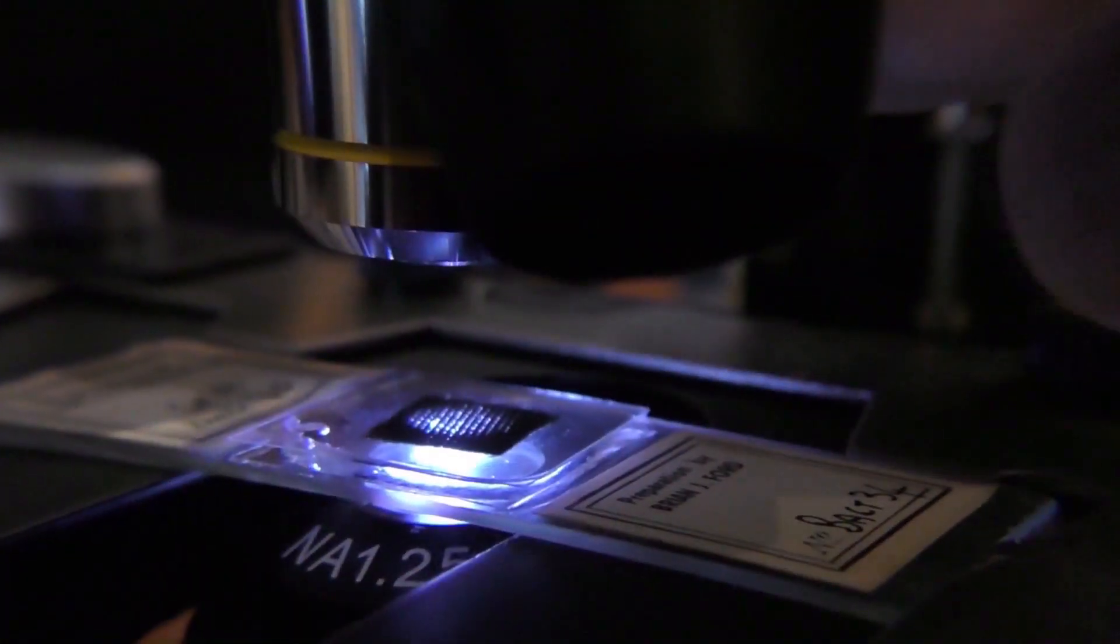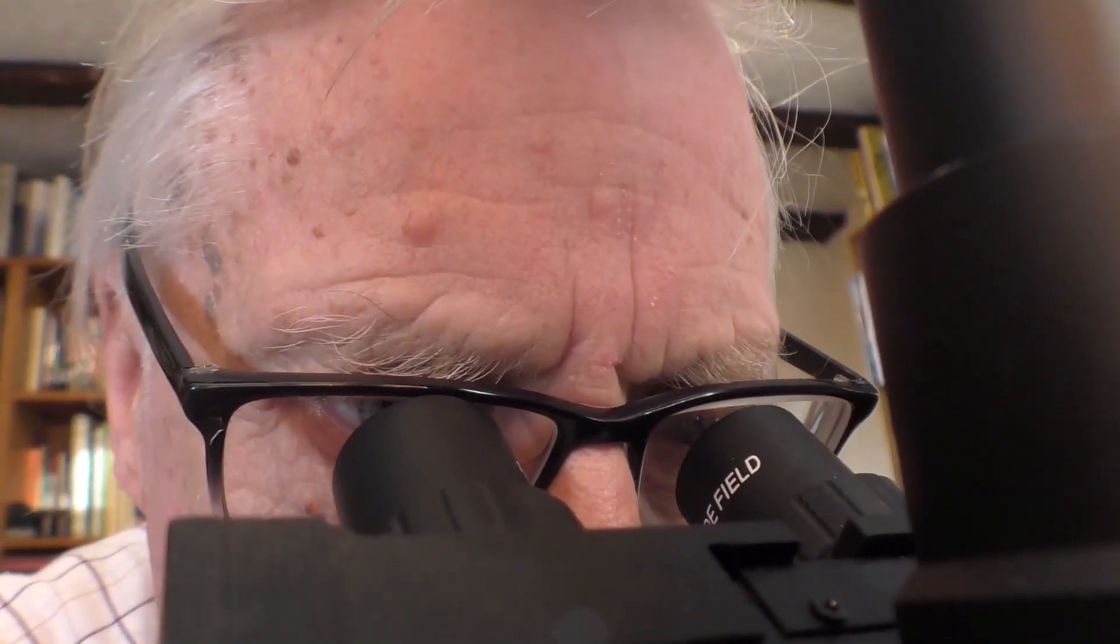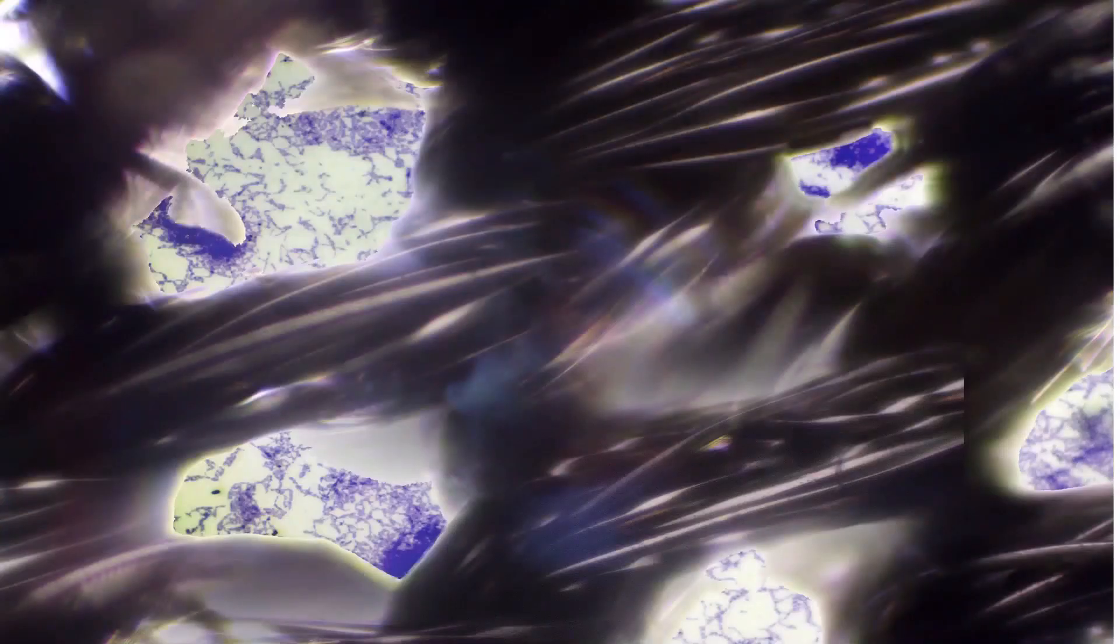And here's the ingenious bit. I mounted the mask on a stained preparation of bacteria, and magnified about 750 times you can see just how small the microbes really are.